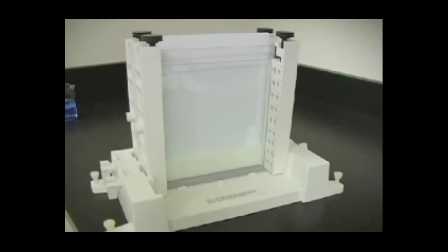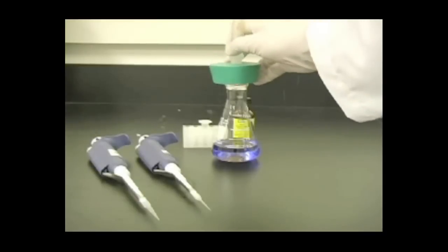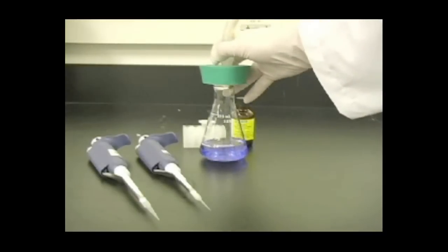Assemble the gel sandwiches and secure them in the casting stand. Prepare the monomer solution according to instructions. Degas under vacuum for at least 15 minutes.